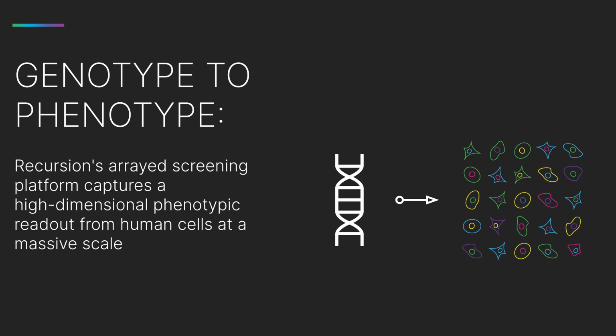Hi, my name is Berton Earnshaw, and I'm a machine learning fellow at Recursion. I'm responsible for Recursion's machine learning strategy. I will now describe Recursion's high-throughput imaging platform for generating high-dimensional, biologically relevant phenotypic readouts, and how we create useful representations of those readouts. These representations power much of Recursion's drug discovery engine.